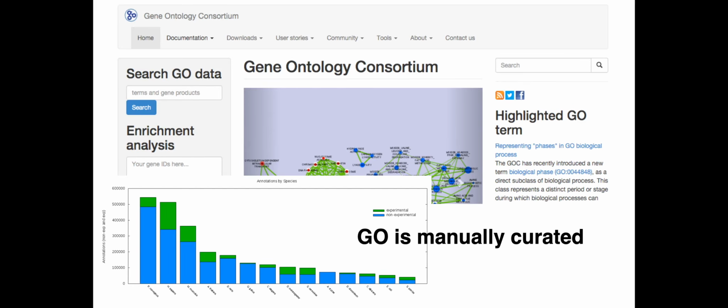Okay, so here you can see we have over 500,000 different annotations for genes in the human genome. We also have lots of annotations for rat and mouse. Again, it's species specific. So if you're working with an organism that is not in this top 4 or 5, in general, carrying out functional enrichment analysis can be really challenging because many of the genes in your organism are not functionally annotated. So you're really going to have to choose your path forward from differential gene expression based on magnitude of expression or significance, availability of reagents, some of those other criteria that I mentioned.